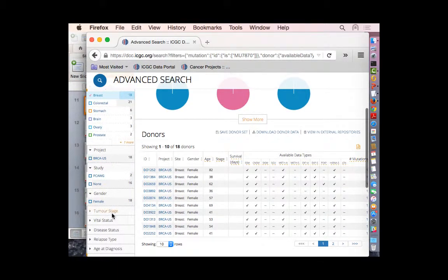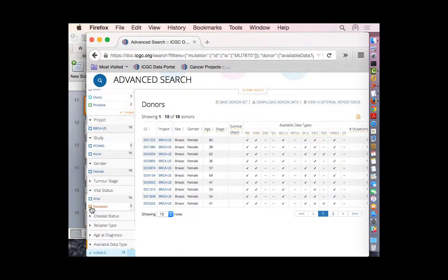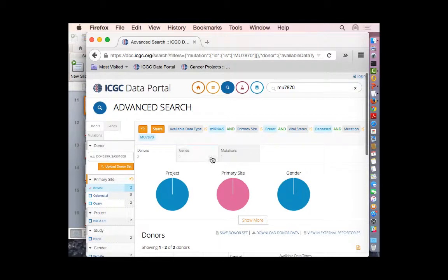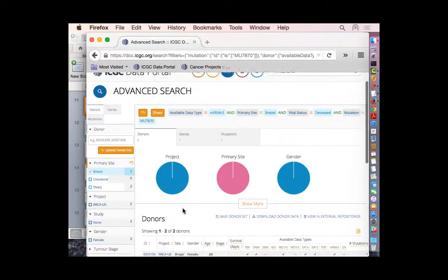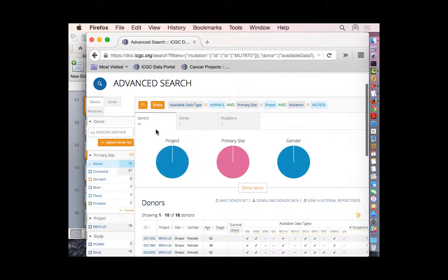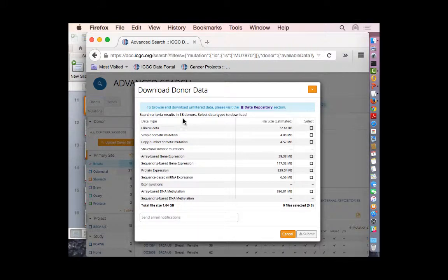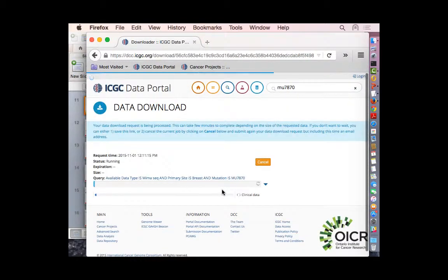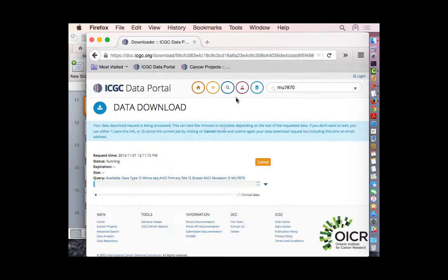Before you narrow down, it tells you how many of each category — for example, if you click on deceased, you have two there. You keep narrowing down, guided through the underlying data content of your filter. When you find donors of interest and want to download data, there's a button to download donor data. This popup window lets you choose which data type you're interested in — for example, clinical data. These 18 donors' clinical data will be downloaded; it's a process running server side, and in a minute or two the file will be provided and you can follow the link to download it.